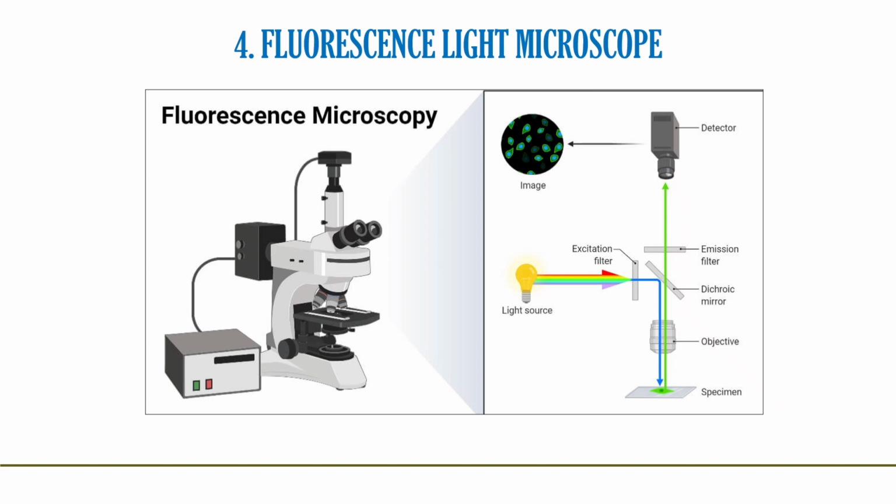Light sources. Fluorescence microscopy requires intense, near-monochromatic illumination, which some widespread light sources, like halogen lamps, cannot provide. Four main types of light source are used, including xenon arc lamps or mercury vapor lamps with an excitation filter, lasers, supercontinuum sources, and high-power LEDs. Lasers are most widely used for more complex fluorescence microscopy techniques, like confocal microscopy and total internal reflection fluorescence microscopy, while xenon lamps and mercury lamps and LEDs with a dichroic excitation filter are commonly used for wide-field epifluorescence microscopes.